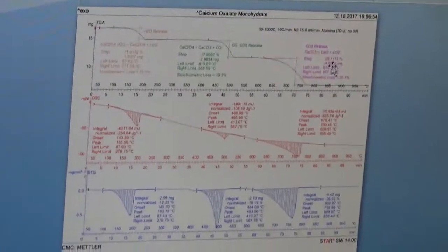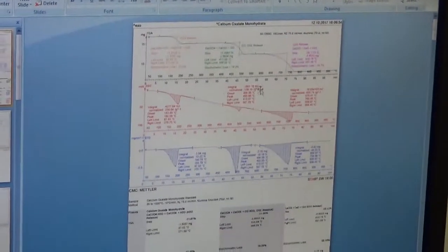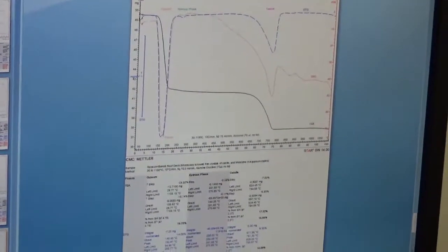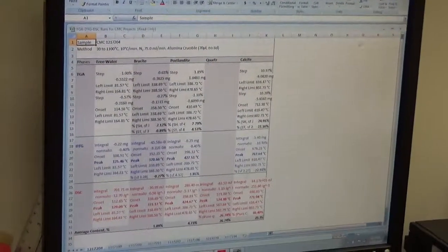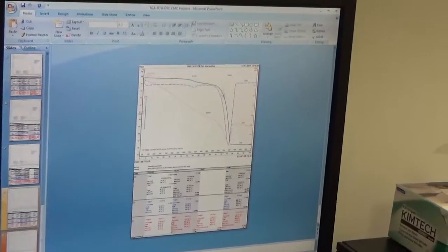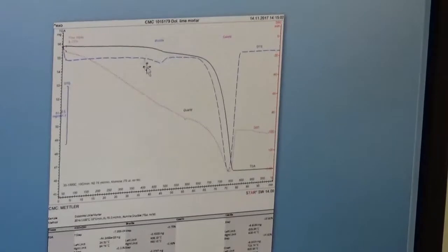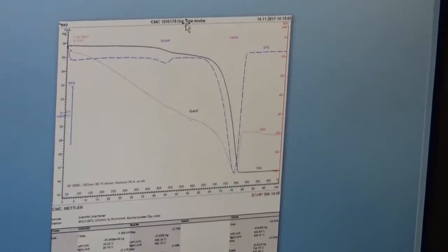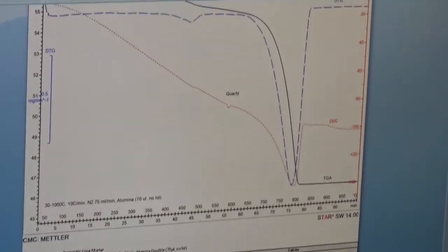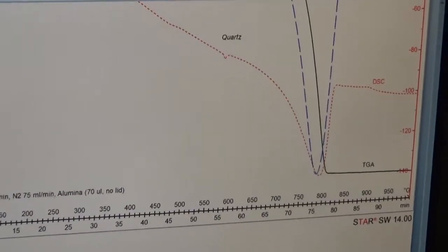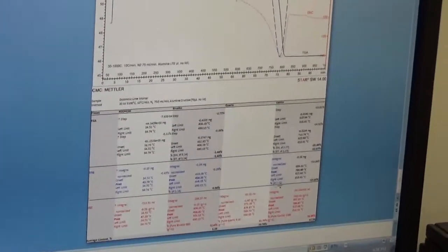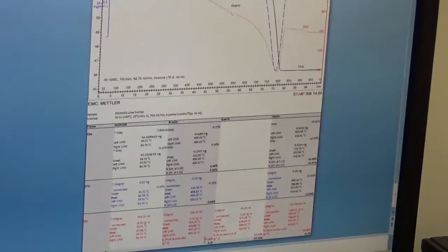I decided not to give the data on the scan itself, but rather give the data separately below the plot as a table. To show some of the runs we did: this is a dolomitic lime mortar which shows the brucite dehydroxylation to determine the dolomitic lime content, and then calcite decarbonation, with a tiny little peak from quartz because it has coarse sand — showing as a small kink in the DSC curve. This sample had about 33% quartz, 32% calcite, and brucite came around 1 to 1.3%.